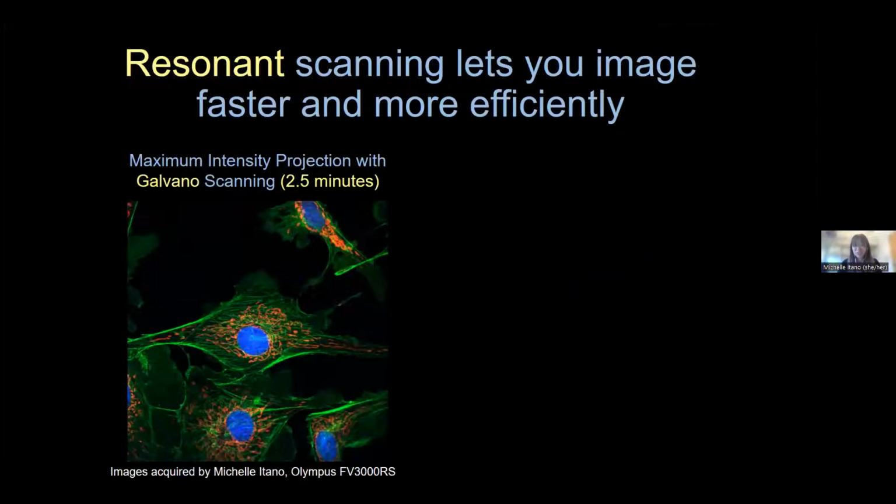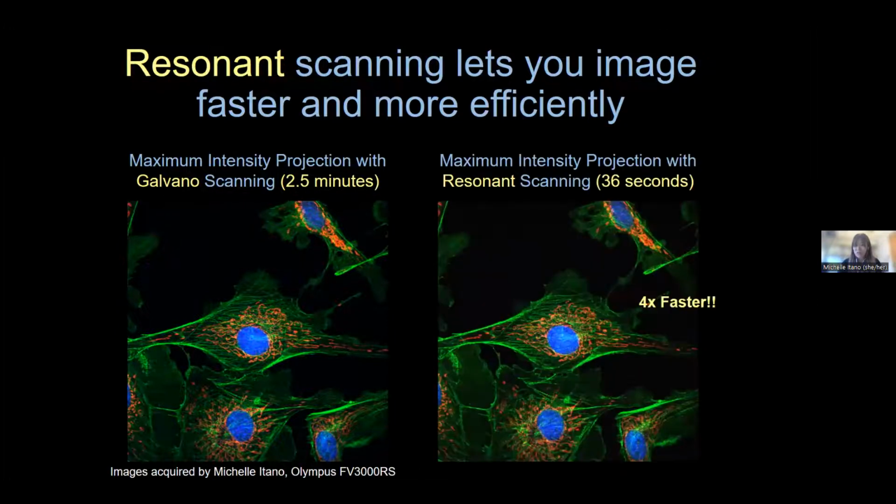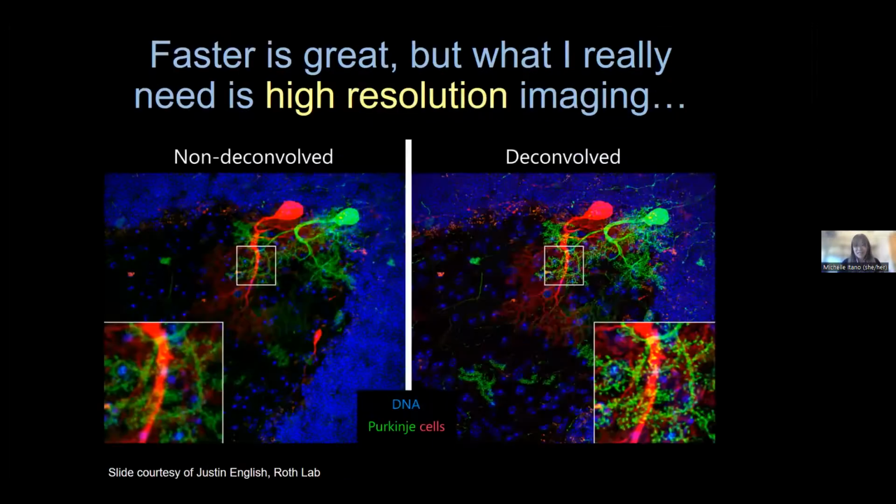So while that is true, that used to be the way that people were imaging, now many things are happening to make imaging faster and more productive. One of those is that instead of standard confocal scanning, you can use different scanning mirrors to do what's called resonant scanning. That moves the laser at a faster rate, and so you can acquire images of similar quality much faster. What we find then is that if instead of wanting to go faster, you want more detail, there are now many ways, either microscopes or post-processing, where you can apply tools and get more spatial detail.